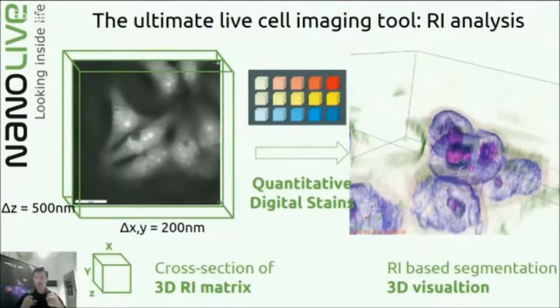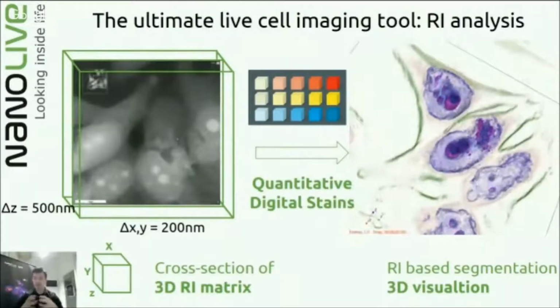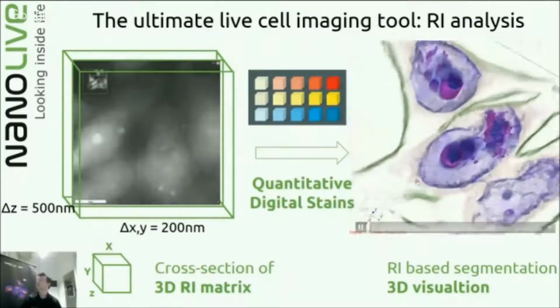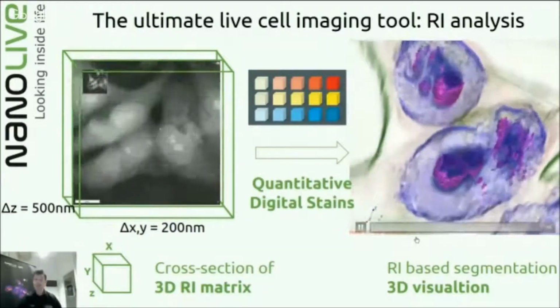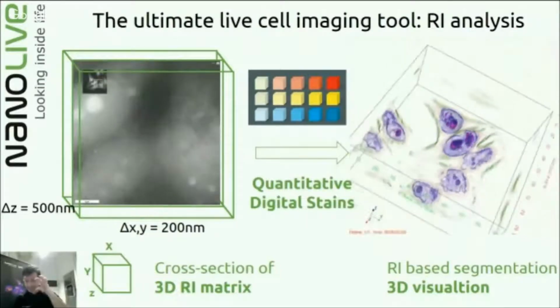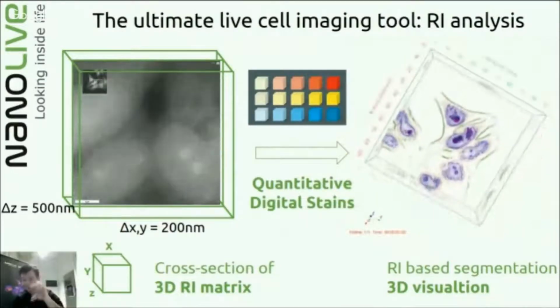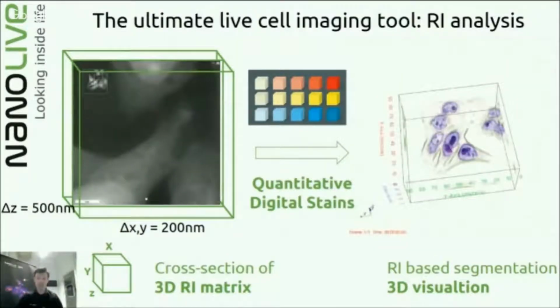This allows us to segment and select only those parts to, in the end, get this beautiful 3D reconstruction that really allows you to go and see what happens inside the cell. You can tilt the cell, you can really look at it from all the side views.